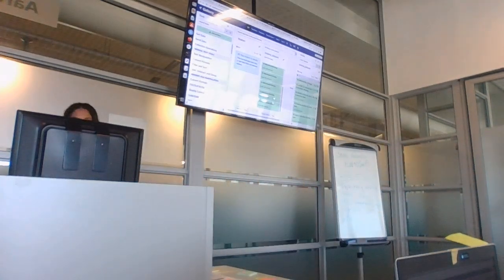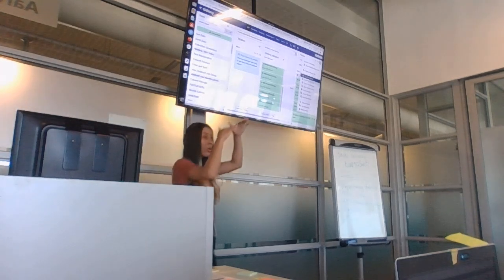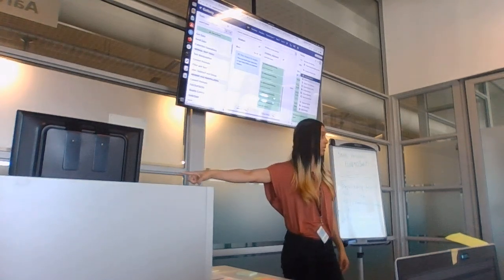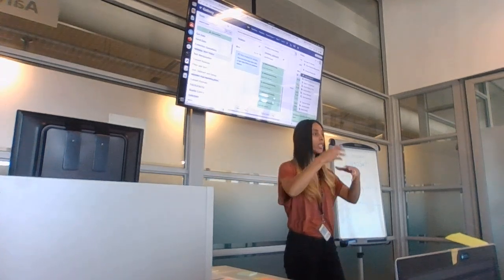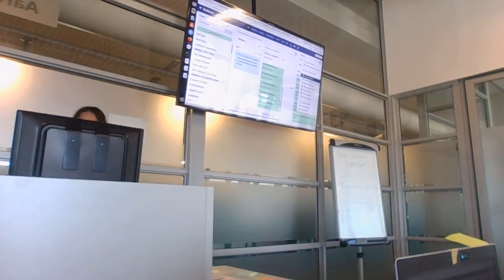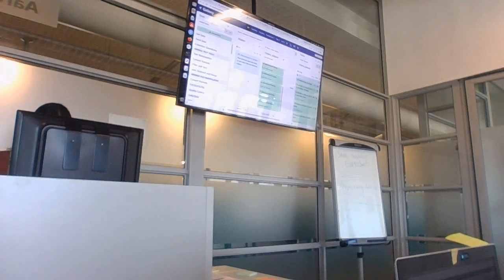So if we pretend these are all my data sets, I would go to copy this history and I would make a copy of all my files single before I make a collection for this situation. So that in the case where you want to reuse the files, they are not in a collection or something where they're unusable. I should have it loose if I stick to my usual. Yeah, I have it loose here.